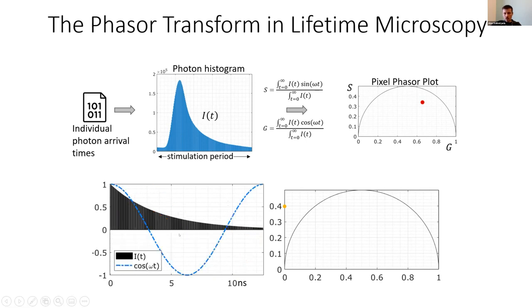You repeat the process for the cosine, which is basically shifted 90 degrees, multiply the 2, sum up the area, and you get some number, 0.2. The combination of these 2 are the 2 coordinates of this specific shape on the phasor plot.